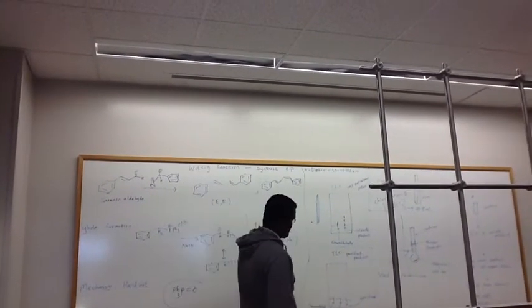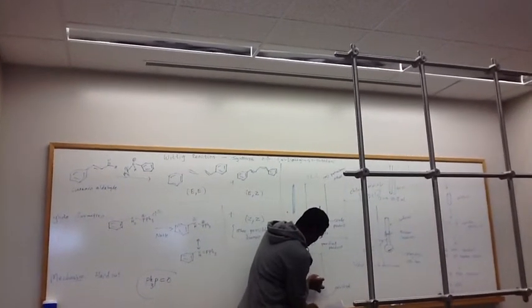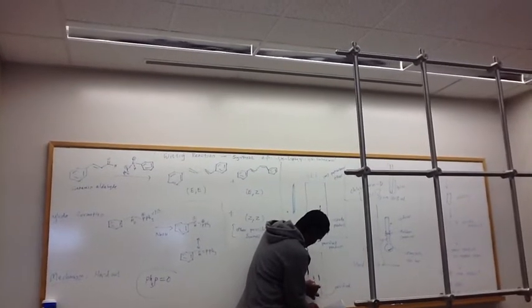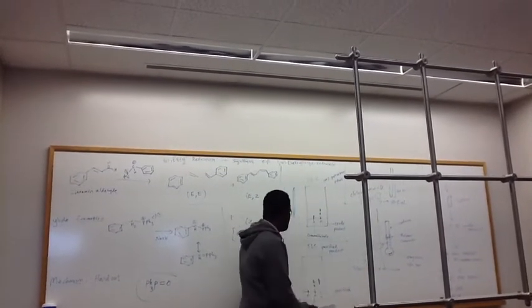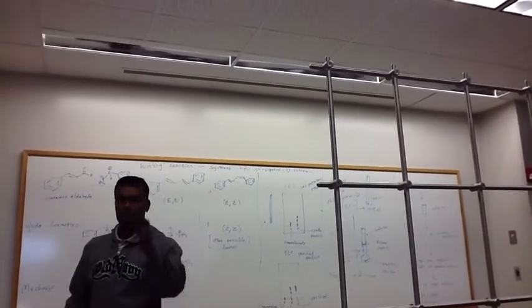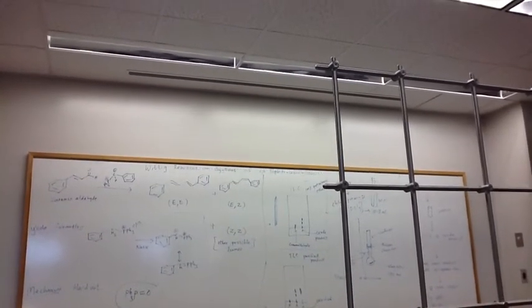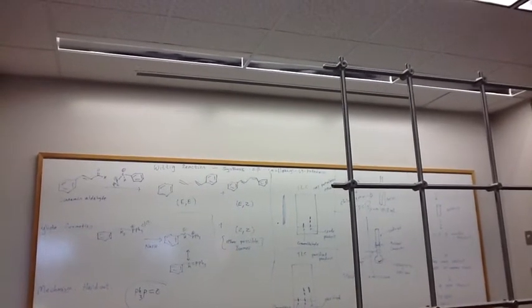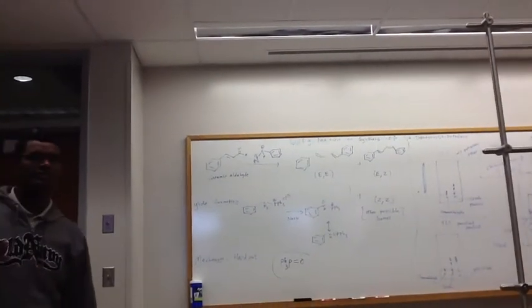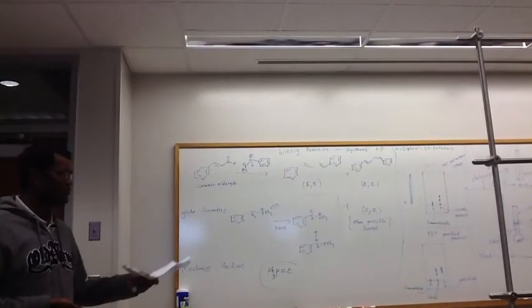So what happens in the purified spot if everything goes okay? We should see only one major spot. Something like that. So here is the crude product and on the rightmost is your purified product. There should be only one spot seen, because we are crystallizing that and getting rid of the other isomers and triphenylphosphine oxide. Those go into the aqueous ethanol and your pure product crystallizes out as a solid. So if everything goes okay, that should be a single spot.